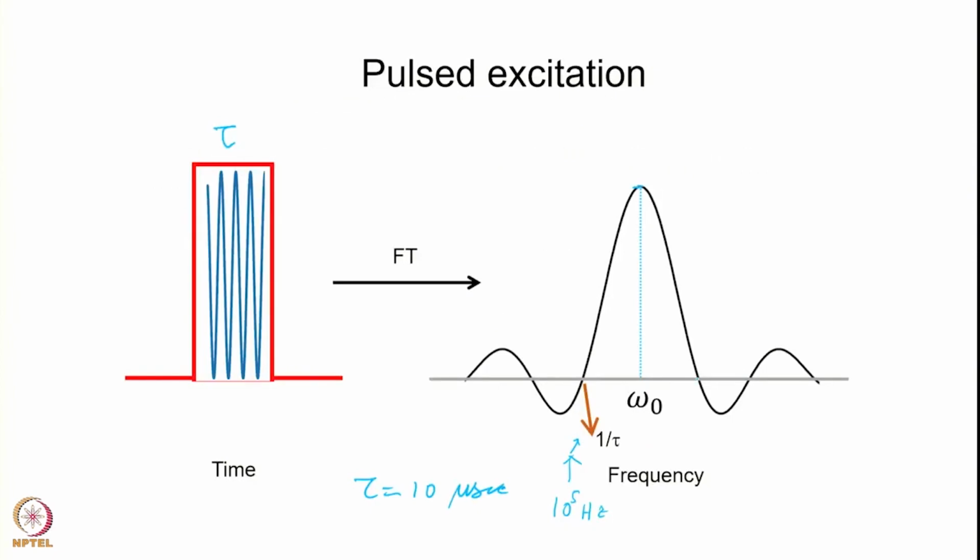So what one does is, this is the wide range, and typically our ranges are of the order of a few kilohertz. Now if I choose a small range here, from here to here, a few kilohertz, that is enough for me. As I said, at 100 megahertz 10 ppm is 1 kilohertz, 1000 hertz. If I take 500 megahertz, 5000 hertz is 5 kilohertz. So that is quite small. I only need to select these many frequencies, and that is enough for me.